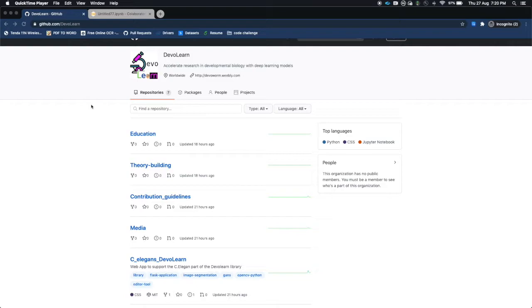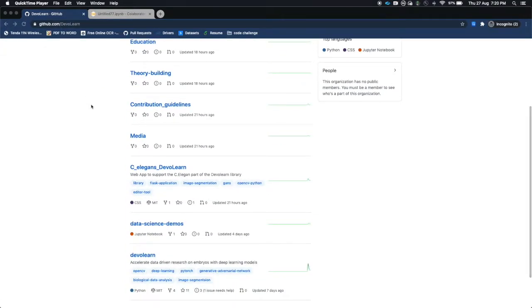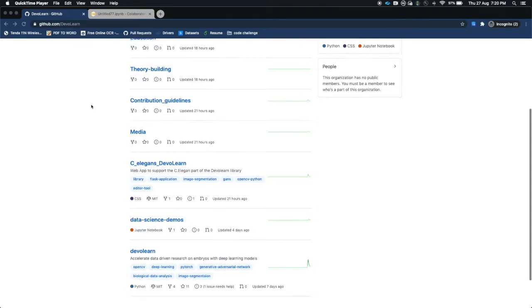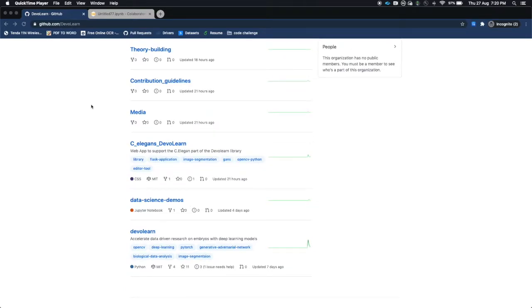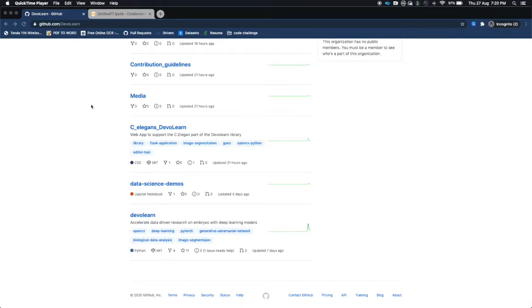As you can see, we have created a small GitHub page for devolearn where we have different repositories for different purposes like education, theory building, contribution guidelines which contains how to onboard for a new user, and media. C.elegans.devolearn is a web app for C. elegans segmentation procedure.